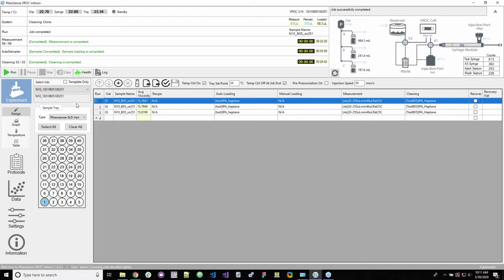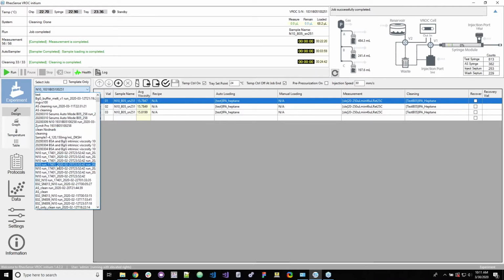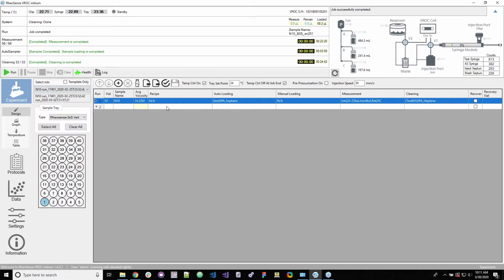So in the experiment tab, it will tell you which job is being saved. So you can actually select this down arrow and you can go through previous tests, previous jobs. So let's say you're running an experiment again, but it's the same experiment that you ran a couple months ago. It's saved in the initium software's memory, so you can select a previous, in this case, N10 run, and it will remember the sample names, the autosampler loading protocol, the measurement protocol, and the cleaning protocol from a previous run.